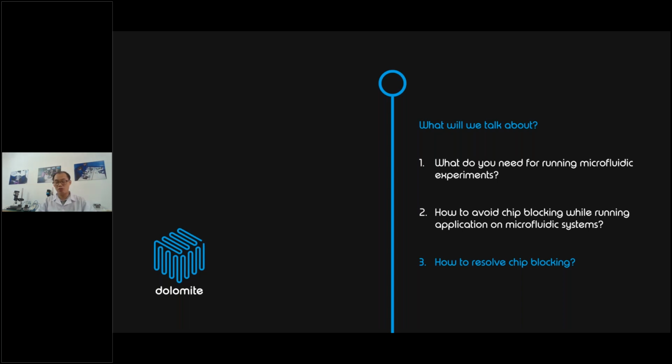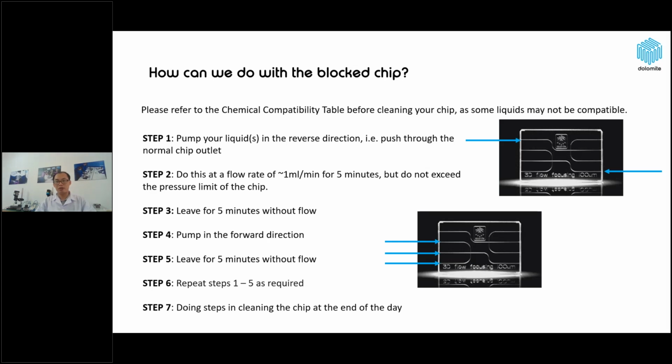If the chip is blocked, what should we do? If the chip is blocked by any dust or contaminant, we can't guarantee 100% that we can restore the chip to work under normal conditions, but we can try several ways to solve the problem.